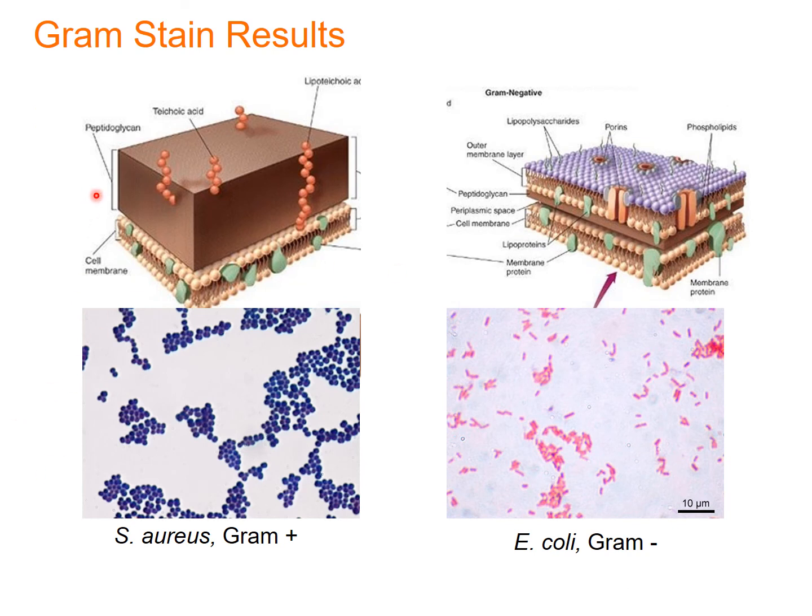Gram-positives with a thick peptidoglycan cell wall retain the purple crystal violet stain, even after they've been counterstained with a little bit of the pink safranin. E. coli that have a thin peptidoglycan cell wall will have had all of their crystal violet washed away with the ethanol, which makes them transparent, and then it makes them available to be recolored with the lighter pink colored safranin stain.